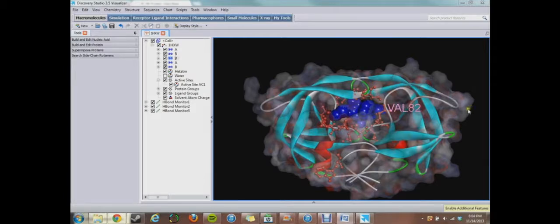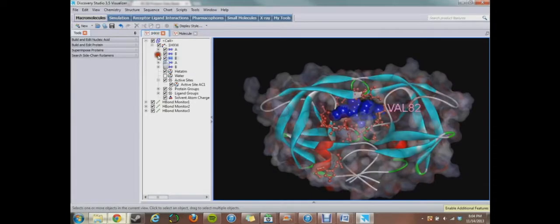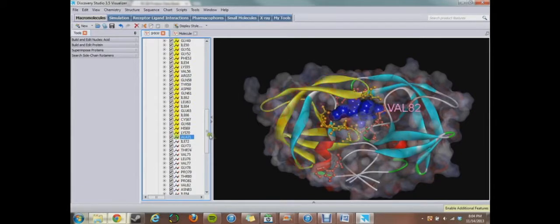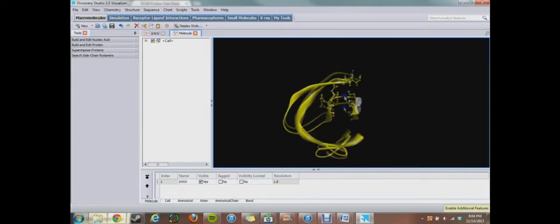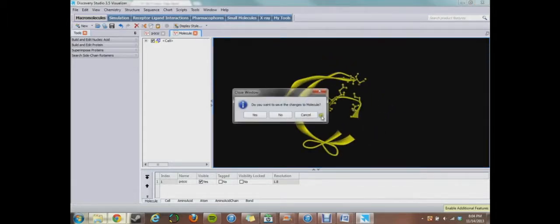If there is a specific thing that you want to copy to a new window to look at, you can go to File, and you can click New Molecular Window. If for some reason the amino acids 10 through 71 are super important to you, you can hit Control C, then go to your new window and hit Control V and just work with this part of your protein. That might be useful for some people looking at certain things. Play around with that if you like.